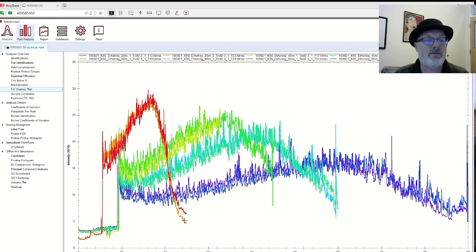And so remember, you're going to pay by time, unfortunately, so I have to charge you. I know, they're mean like that. So anyway, we've seen the 25-minute runs did a pretty good job.